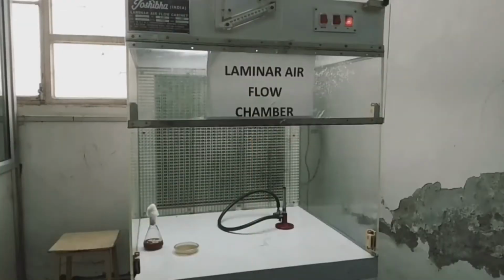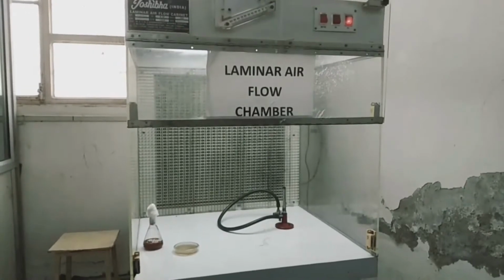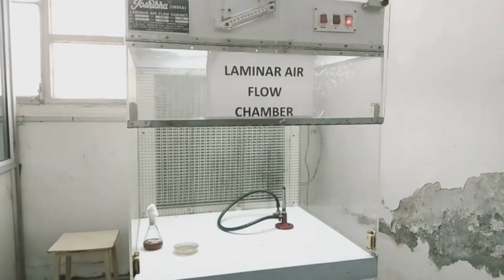Okay, first instrument is laminar airflow. This is the instrument where the proper sterilization work is done. Means that here a proper sterilized condition is provided to us, in which we can do different types of laboratory work such as culture inoculation, pure culture techniques, spread plate method. There are lots of techniques, as I had told in the previous videos. So all the works are done in this chamber.